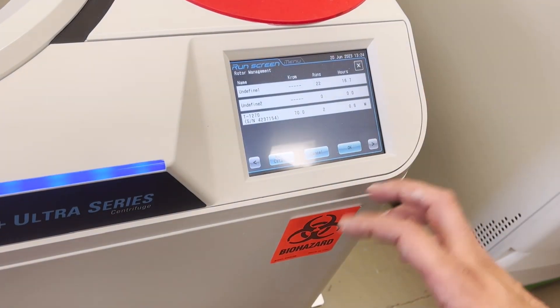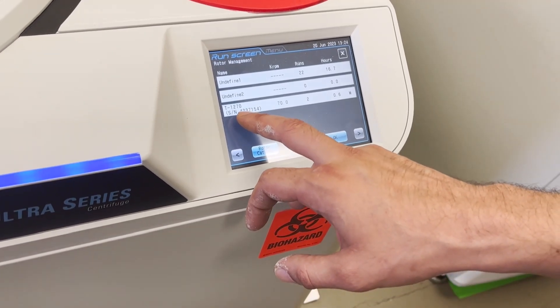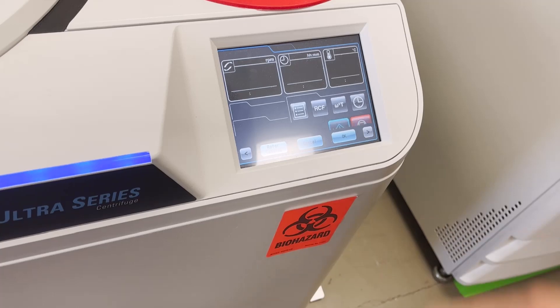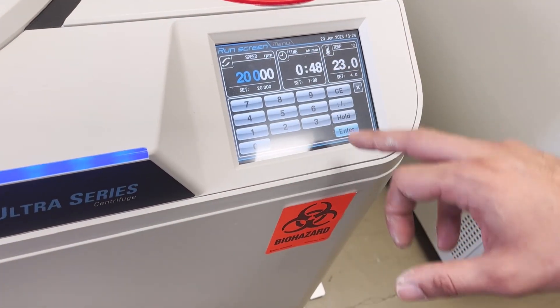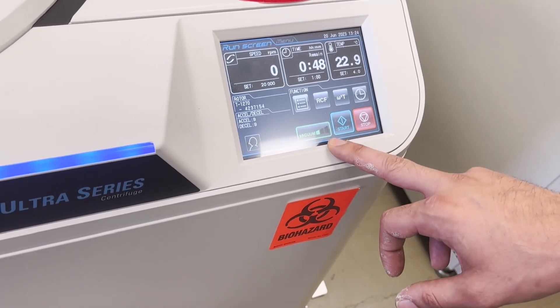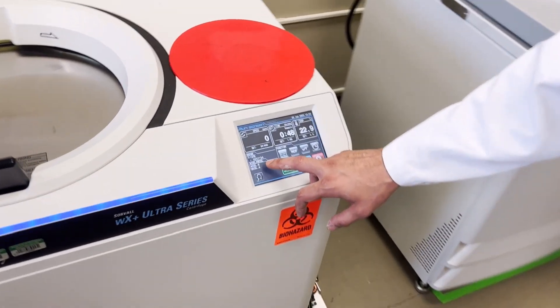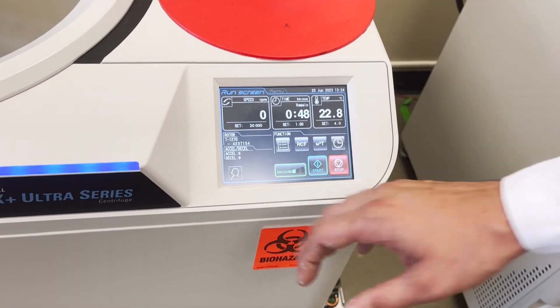There is a list of different rotors you can find in the catalogue. We select the one we have. Now the machine knows what rotor it is. Then you enter your speed, time, and temperature, and when the vacuum is completely on, you press start.